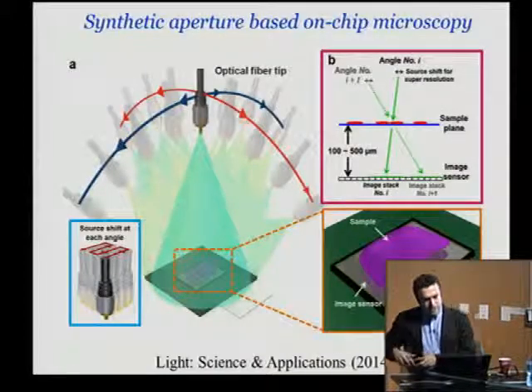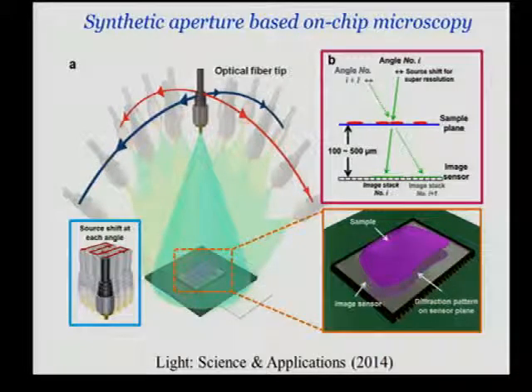If you want to push the resolution further, you can also have some other tricks. One trick that we've utilized is to play with the illumination angle. Vertical illumination gives you a certain band that is diffracting. As I shift the illumination angle, some of the evanescent waves or some of the higher frequencies that are normally going to be missed away because of the pixel architecture will start to shift to lower frequencies. And vice versa, DC will start to shift to higher frequencies.